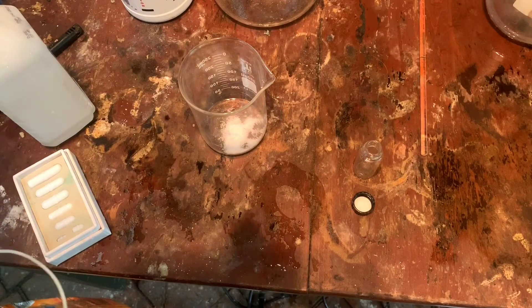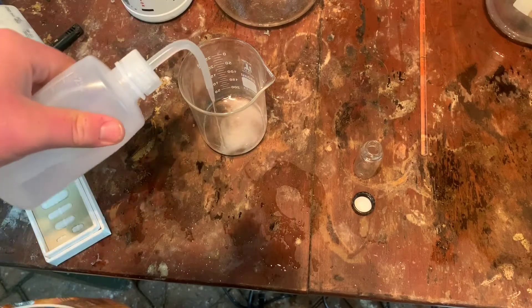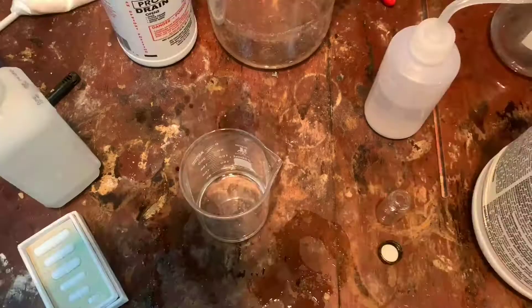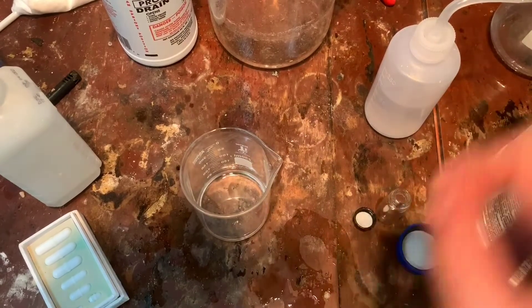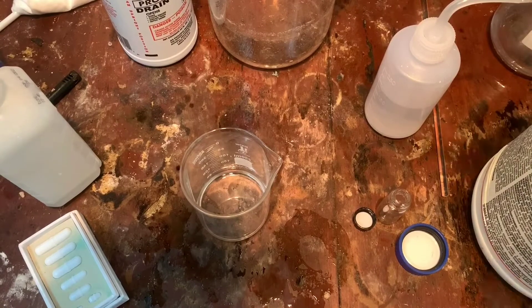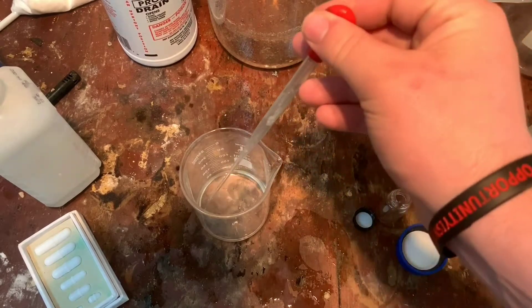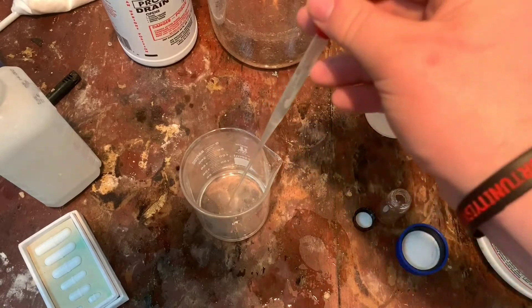We're going to want to dissolve this in distilled water — this is just plain distilled water. Then get your concentrated hydrochloric acid. Next I'm going to add 3 mL of concentrated hydrochloric acid by dropper. One, two, three.